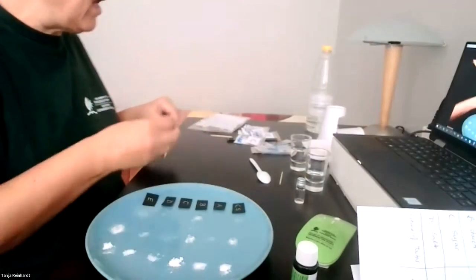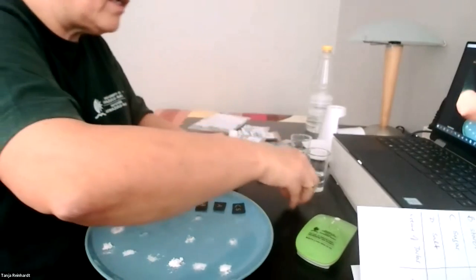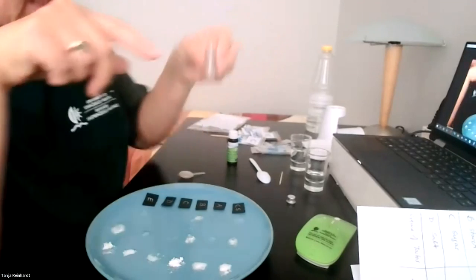Okay, so coming now to our iodine. Right, as you can see, I'm not wearing gloves, so I'm probably going to run around with yellow fingers just now. So what I've got in here is just a little bit of water. Okay, can you see? It's not much. A little bit of water.